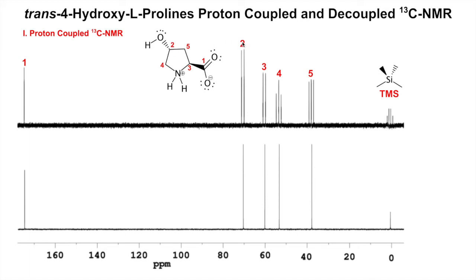And normally though, I think it's normally, I've never actually done an NMR like this, people don't normally do this. So this carbon has 1 hydrogen on it. It can reach out and be coupled by those 2 hydrogens as well, this particular carbon. So if it's coupled by this hydrogen and these 2 and those 2, then it gets really messy. We'll look at an example like that next.